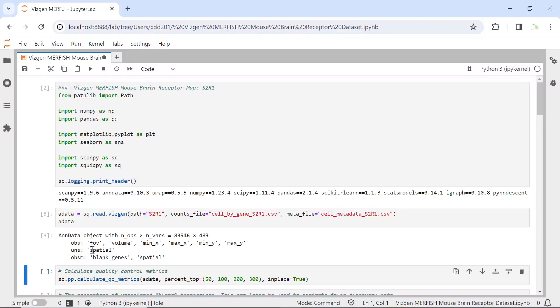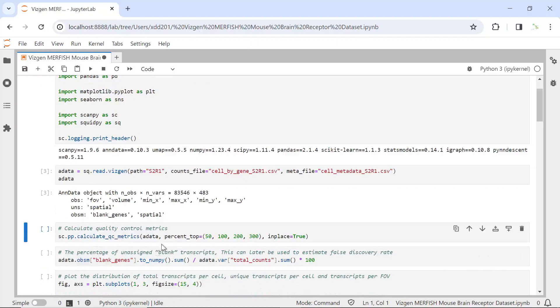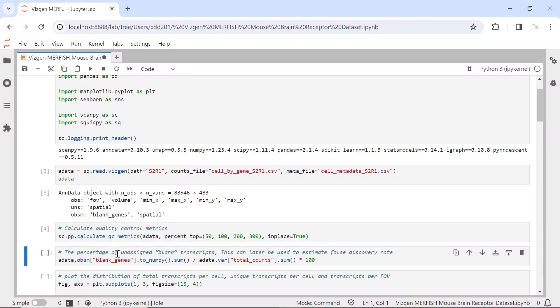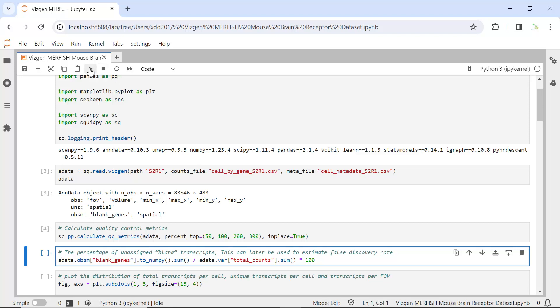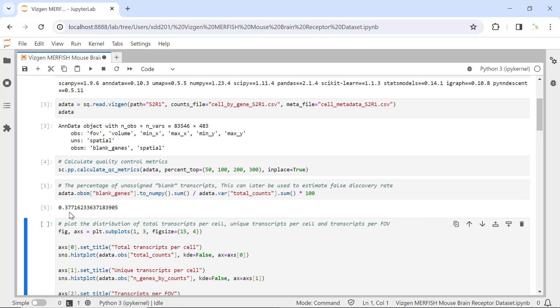You can see the observations, unstructured observations, and the multi-layer observations. Once we loaded the data, we can calculate the quality control metrics. In the multiple observations, we have blank genes. We can also calculate the percentage of unassigned blank transcripts, which can be used later to estimate the false discovery rate. You can see it is about 0.38 percent. So now we have all the quality control metrics.